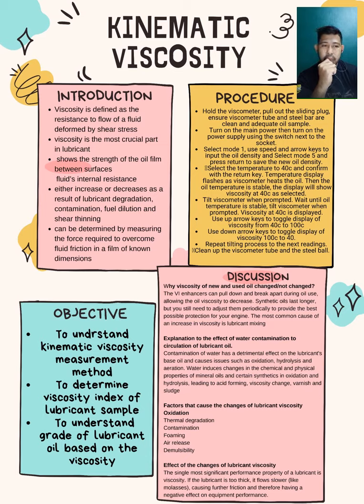Today I would like to present about lab one, which is the kinematic viscosity. As we know, viscosity is defined as the resistance to flow of a fluid deformed by a shear stress. Viscosity is the most crucial part in lubrication. It shows the strength of the oil film between surfaces.